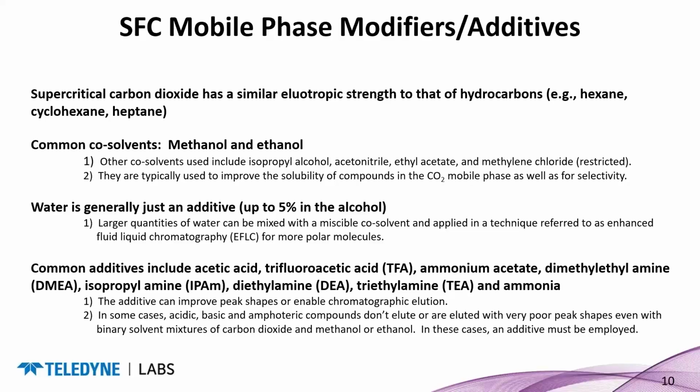Generally, you want your sample to be readily soluble in that co-solvent, so that often affects the choice too. But you also have to get separation or selectivity on whatever stationary phase you're using when you're doing your analytical screening.